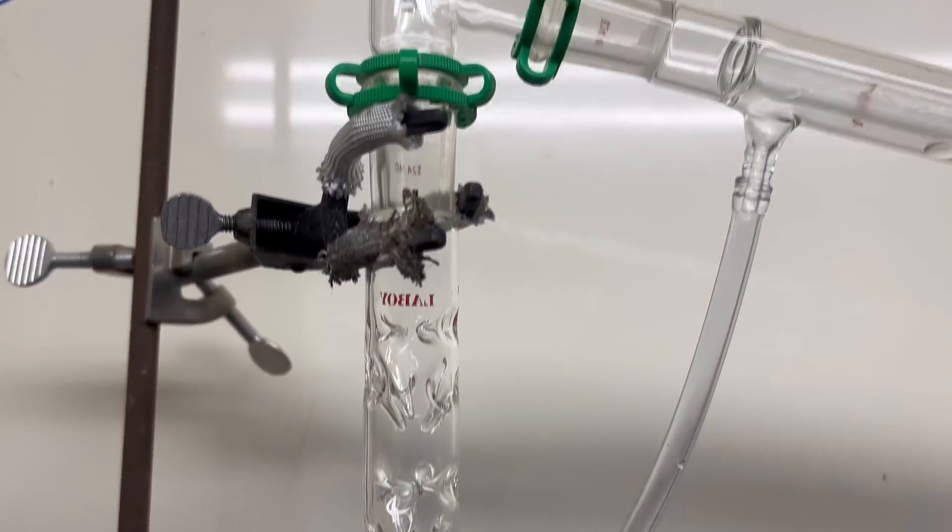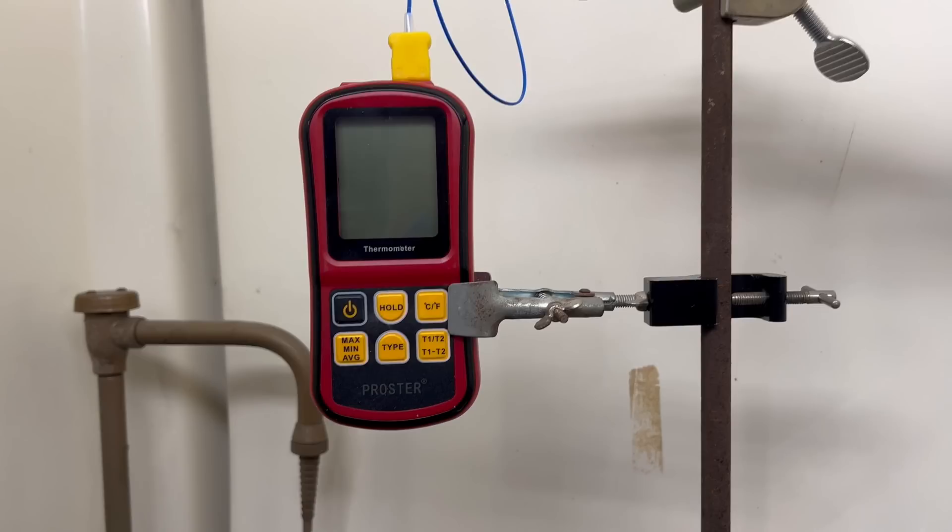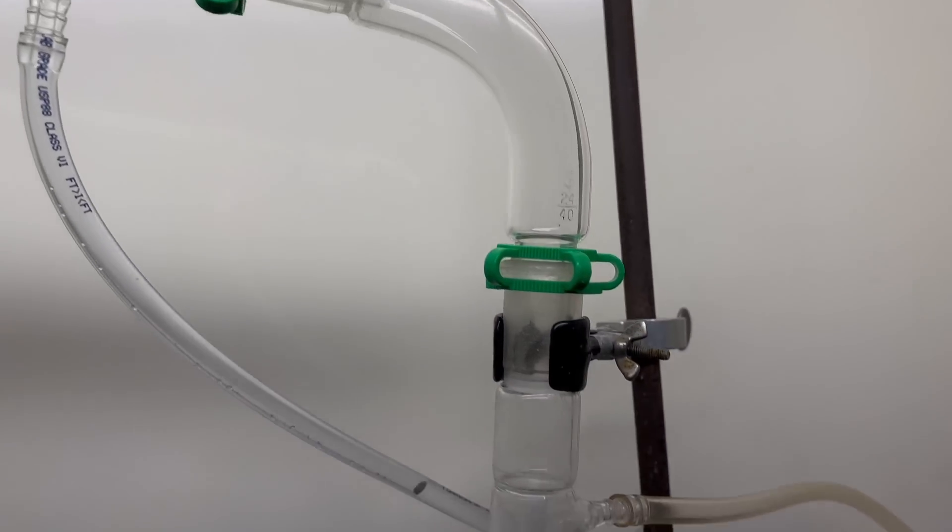Above the column, before the condenser sits a temperature probe, this gives the current temperature of the distillate coming over. We are looking for about 170 degrees Fahrenheit, 76 degrees Celsius, for carbon tetrachloride.